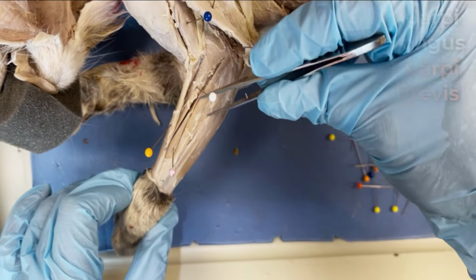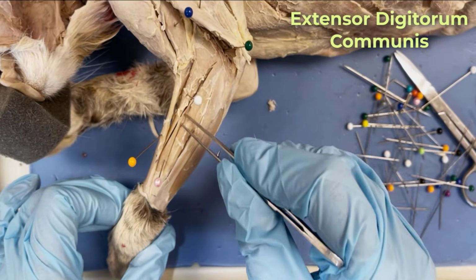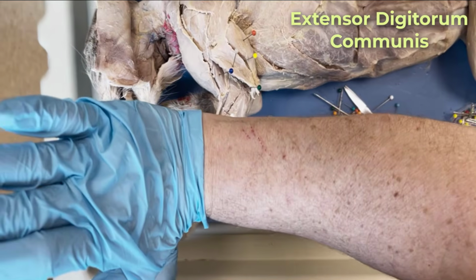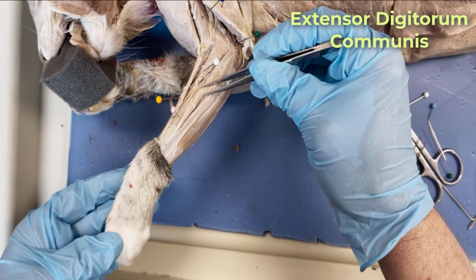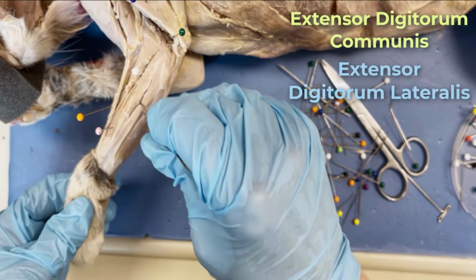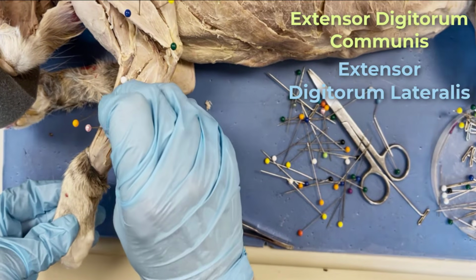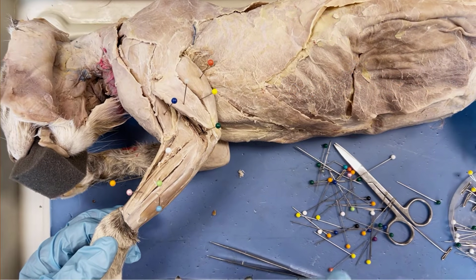And then here is extensor digitorum communis. So now these 2 muscles here, extensor carpi radialis longus and brevis, they're going to cause the wrist to extend. So to kind of do this sort of thing. And when we get to our extensor digitorum communis, that's now going to help extend the toes of that front paw there. So extensor digitorum communis, and right next to it is extensor digitorum lateralis. Same thing, it's going to help raise the toes there. Do light green for extensor digitorum communis. All right, we've got our teal pin is going to go into the extensor digitorum lateralis. At least it's light blue.